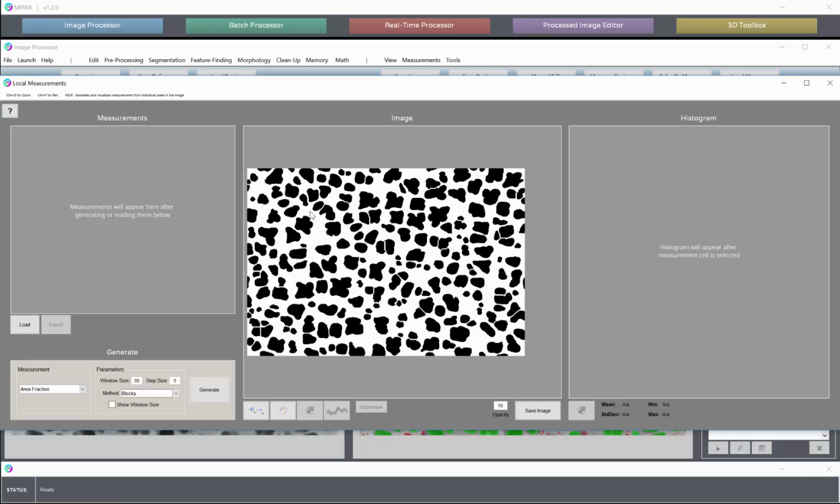The measurement would be made around the first pixel and then around the 5th pixel, and the ones in between would be interpolated. This can be useful for images that have periodic structures where sliding across every single pixel can produce some artifacts in the measurement. We won't really demonstrate this today, but it is there as a tool to help get over some periodic structures that can appear. Sliding is the most commonly used.